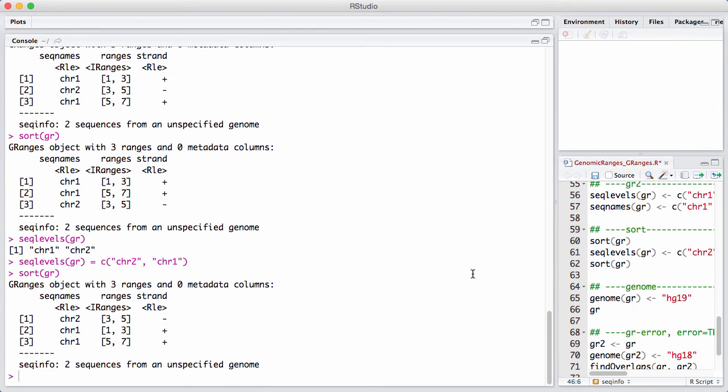This is especially useful if you want to sort things with chromosome 1 and chromosome 10. In sort of standard computer sorting, chromosome 10 would happen before chromosome 2.